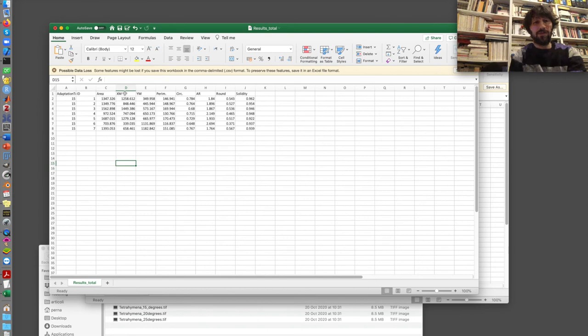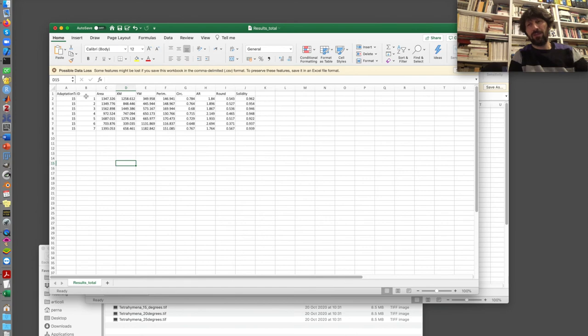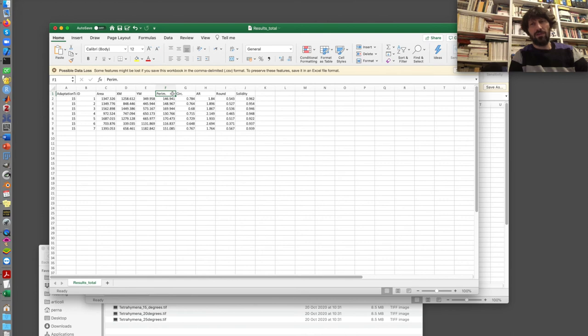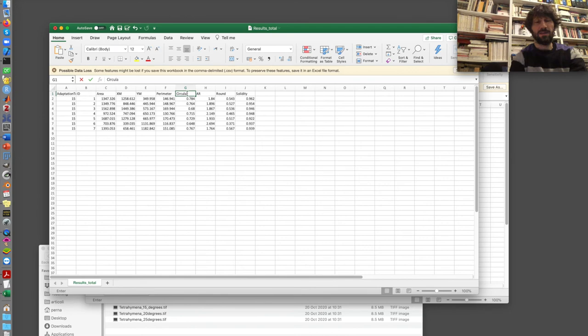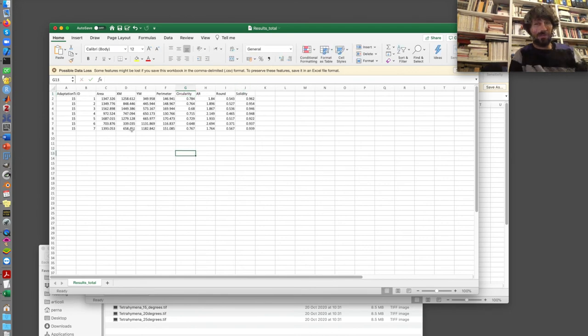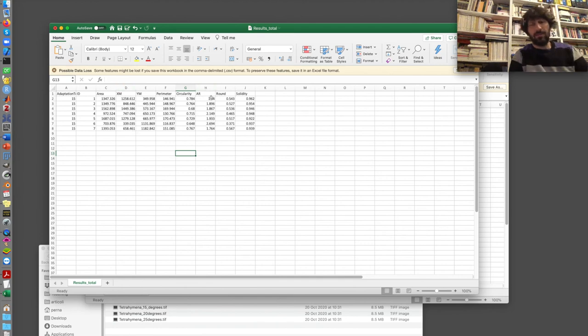This has no header as I add one something ID. This area. You know, you need to remember what we said in the previous sessions. Don't leave empty cells. Don't use dots or other symbols other than the underscore. So I replace Perim with Perimeter. And I replace Circ with Circularity. The other columns are more or less okay. These are the X and Y coordinates of the centroid. The aspect ratio. We don't care too much because today I want to focus on area mainly, I would say.